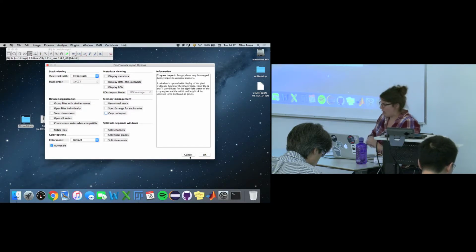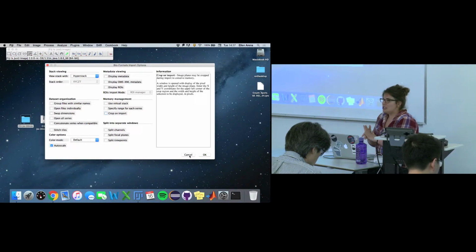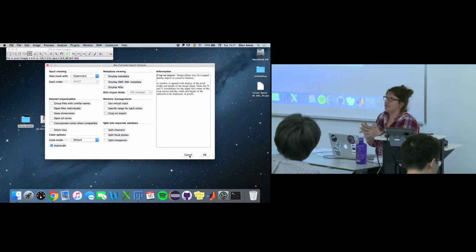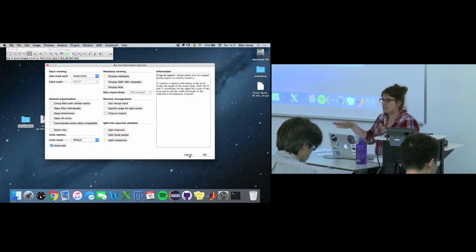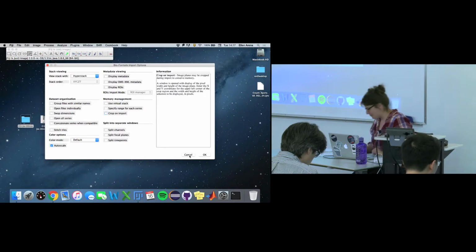So yeah, there is a third option. I'm just going to mention it here quickly. Right now, we're not going to go into too much detail because it's not really up and running yet. But I just want you to know that ImageJ is developing our own file format reader called SCIFIO, and that one day it's basically like Bio-Formats for ImageJ. So that will soon be the default for opening images. Now we won't have to deal with this: should I use drag and drop? Should I use Bio-Formats? It'll just be open image. Simple. But unfortunately today, it's not so simple, but just use Bio-Formats Importer and you'll be good. Okay? Okay.